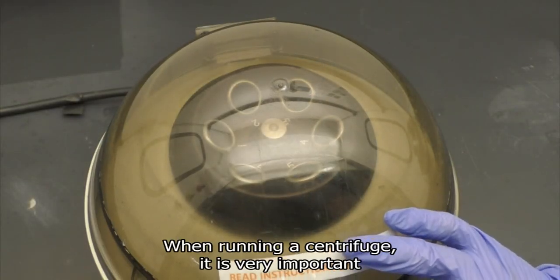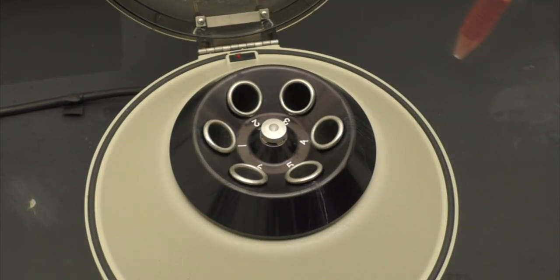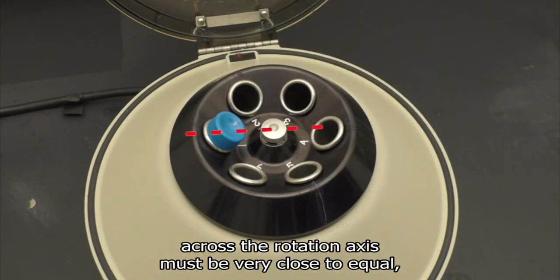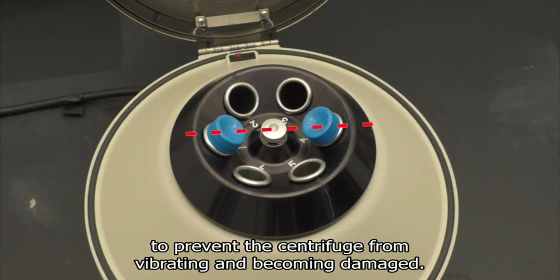When running a centrifuge, it is very important to balance the centrifuge by weight. This is because the weights paired across the rotational axis must be very close to equal to prevent the centrifuge from vibrating and becoming damaged.